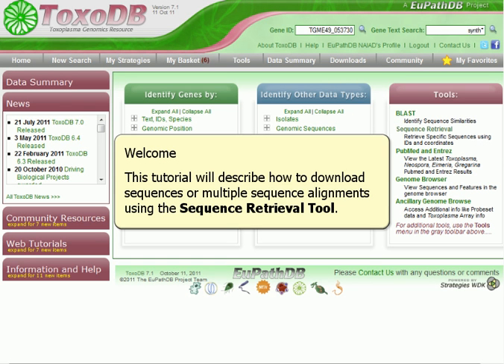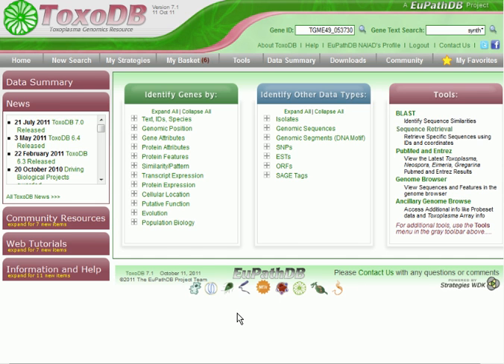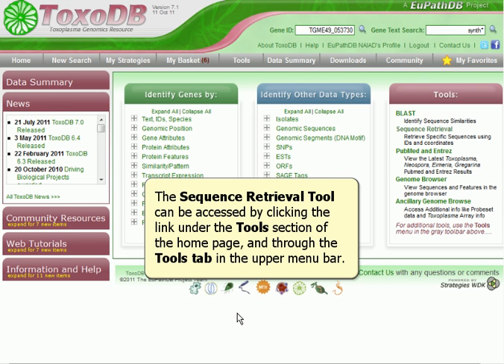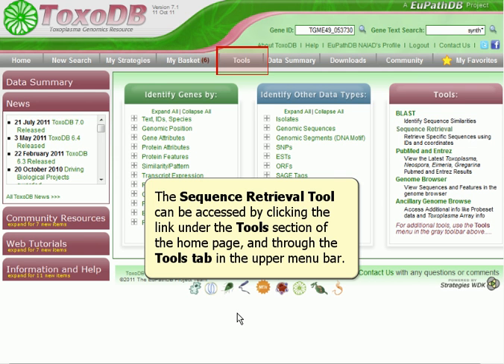Welcome. This tutorial will describe how to download sequences or multiple sequence alignments using the Sequence Retrieval Tool. The Sequence Retrieval Tool can be accessed by clicking the link under the Tools section of the home page and through the Tools tab in the upper menu bar.